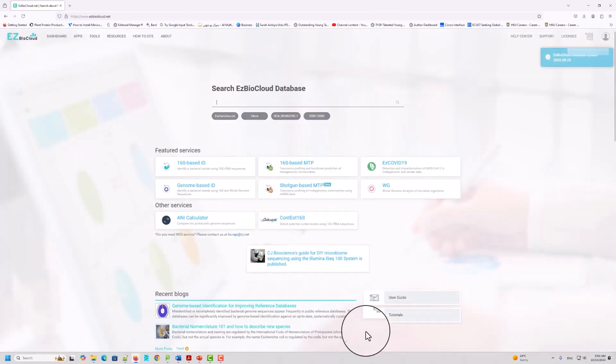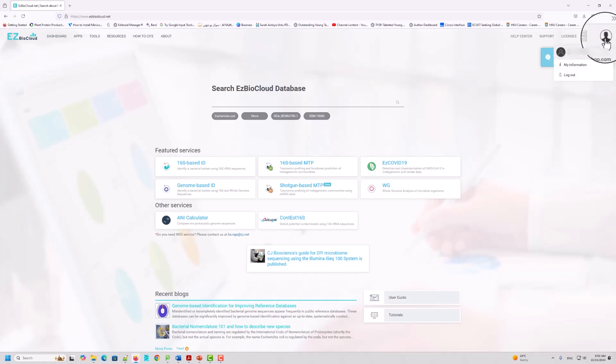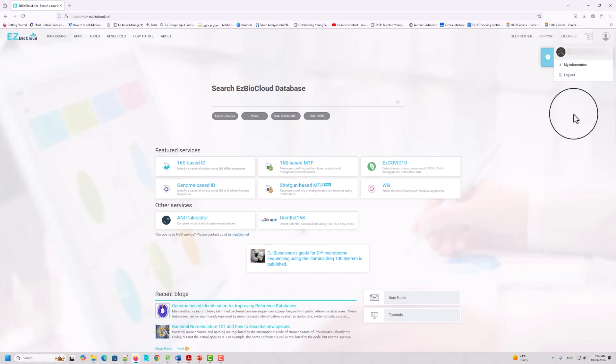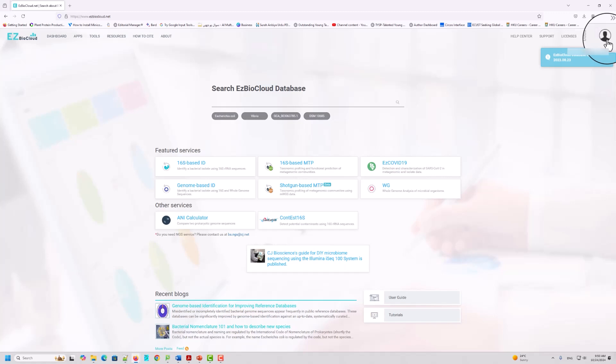When you click the database, if you are using it for the first time, you should come here and log in with your own account. You should create an account — account creation is free. When you create an account, all your data will be saved here automatically.